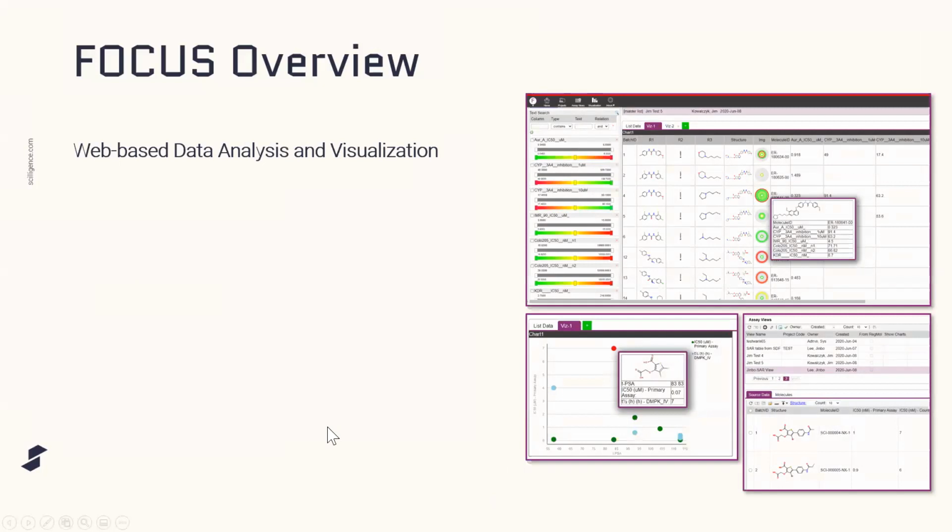So what is FOCUS? FOCUS is essentially our web-based data analysis and visualization tool that we developed and released last year to fill in the gap that we had from Regmol with regards to visualization and just filtering through the bioassay data that's collected when doing drug discovery. And so the beauty of it is that it integrates with Regmol. It's a thin client, and that it's web-based, and that it's evolving to meet our clients' needs.